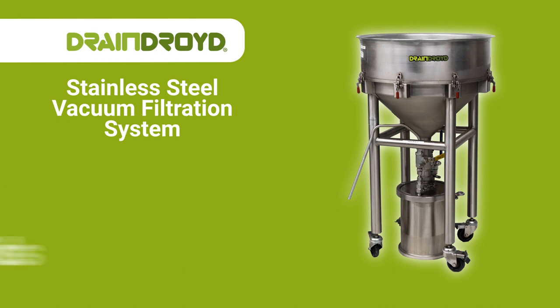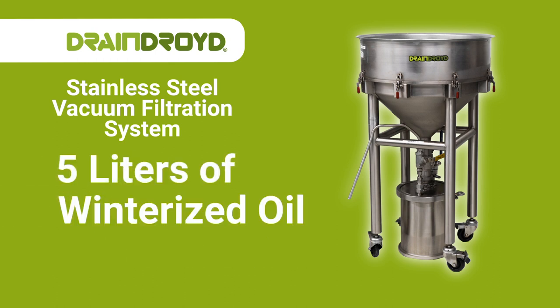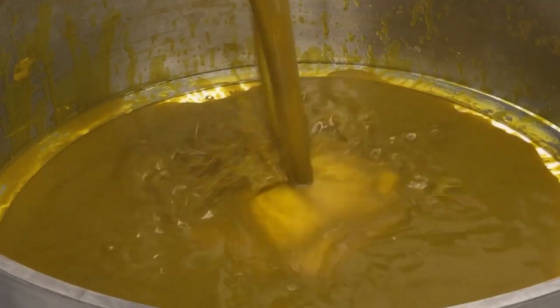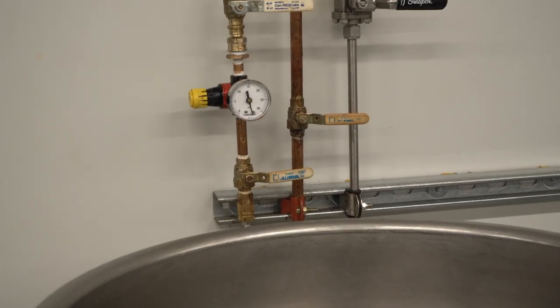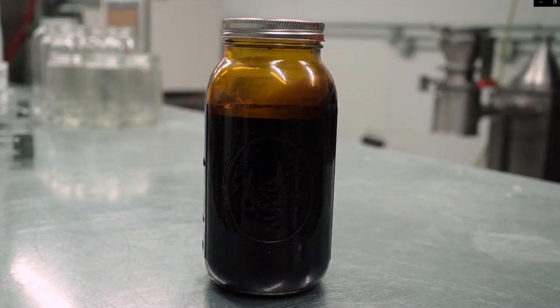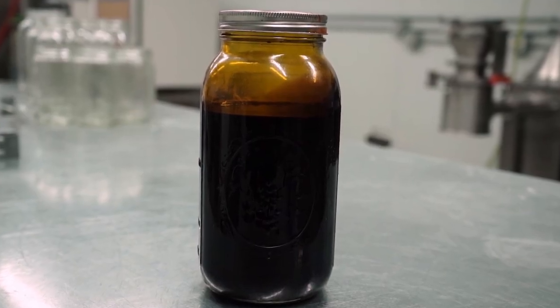DrainDroid is capable of filtering 5 liters of winterized oil in just 5 minutes. In just a few easy steps, you're on your way to quality winterized oil. First, you pour in the oil, then you turn on the pump, stir it around, spray the top, and finally collect all of your hard-earned quality oil in record time.